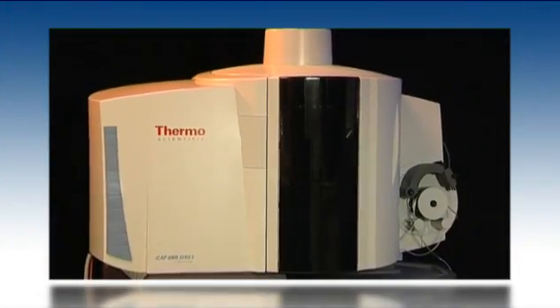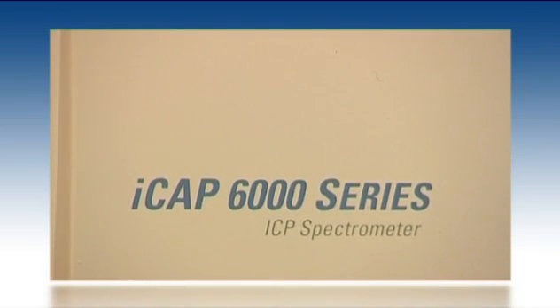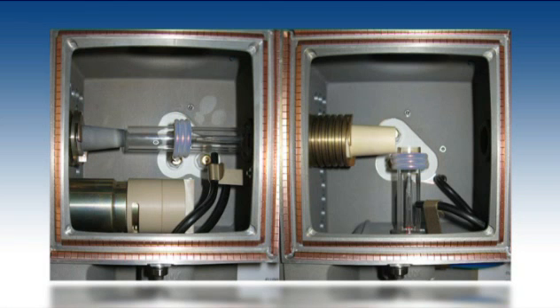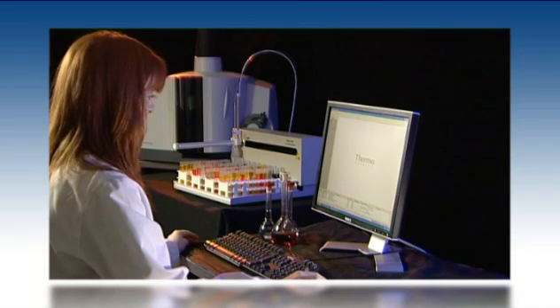Thermo Scientific invites you to experience the dramatic difference of the iCAP 6000 series ICP. With a range of models, each offering dedicated radial or duo plasma viewing, there's an iCAP 6000 that's suitable for every laboratory.